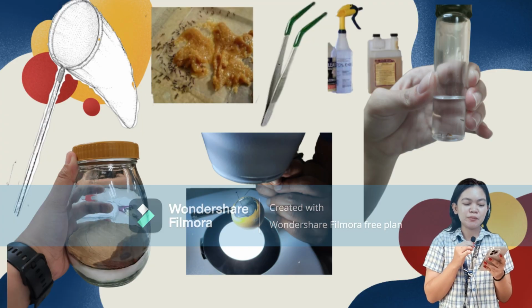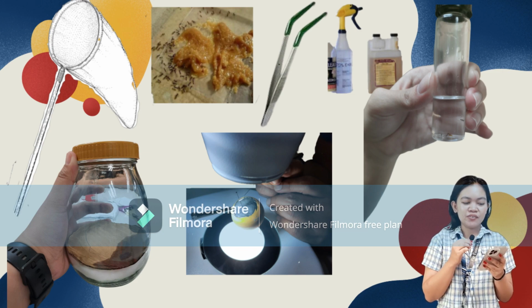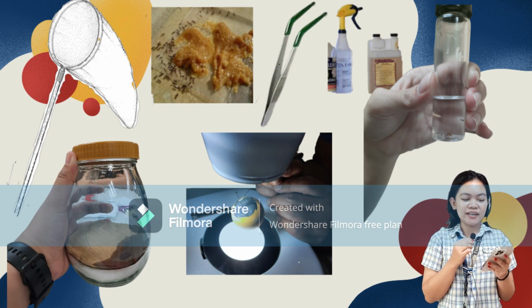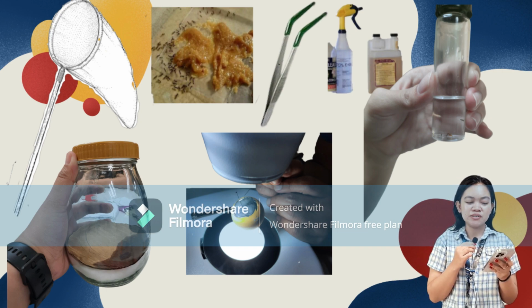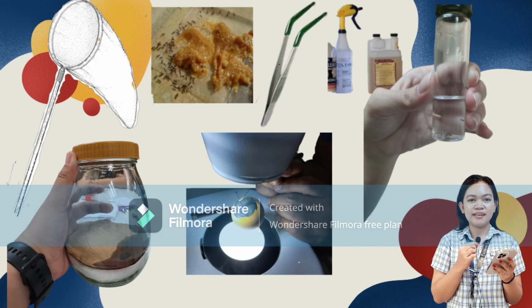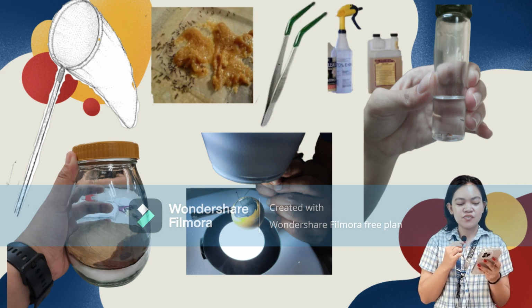Today we will discuss the list of collecting tools for arthropods used in lab exercise 2. First is the forceps, which are delicate handling tools. Next are the vials containing preservatives, containers for specimen preservation. Next are killing bottles and small storage containers for safe specimen storage. Next are small envelopes and gel cups, which are temporary storage for delicate specimens. Next are aspirators, which are suction devices for arthropod collection.